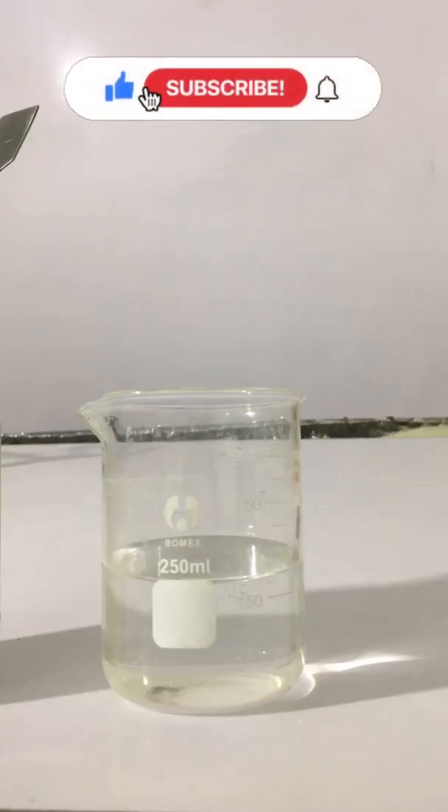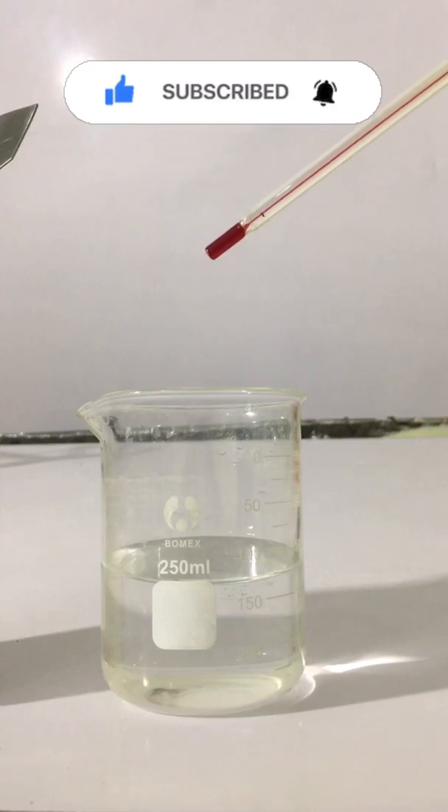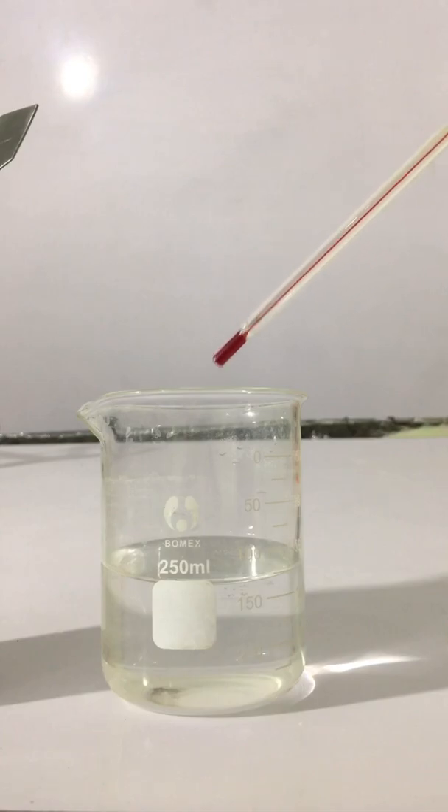Hi everyone, today we will perform a short experiment to identify how when certain salt is dissolved in water it decreases the temperature of water.